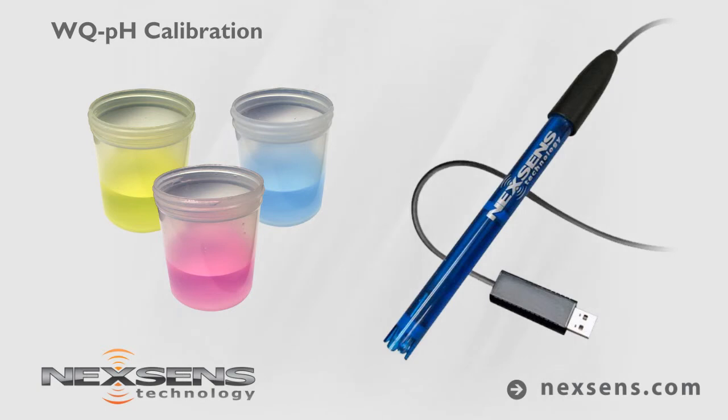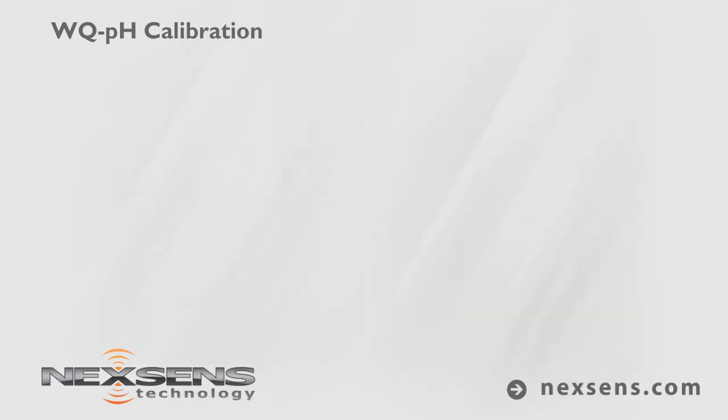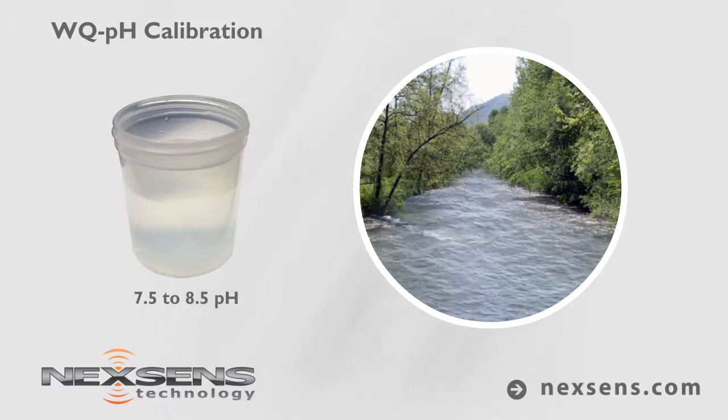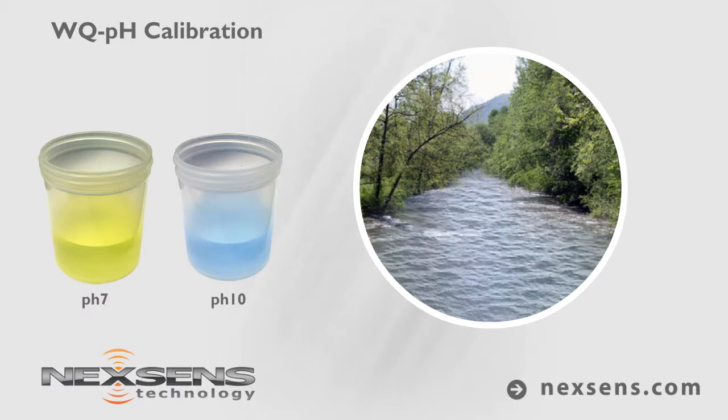To perform a two point calibration, select pH buffers based on the expected measurement range. For this demonstration, the sensor will be used to determine the pH of river water with an expected range of 7.5 to 8.5. 7 and 10 buffers will be used.